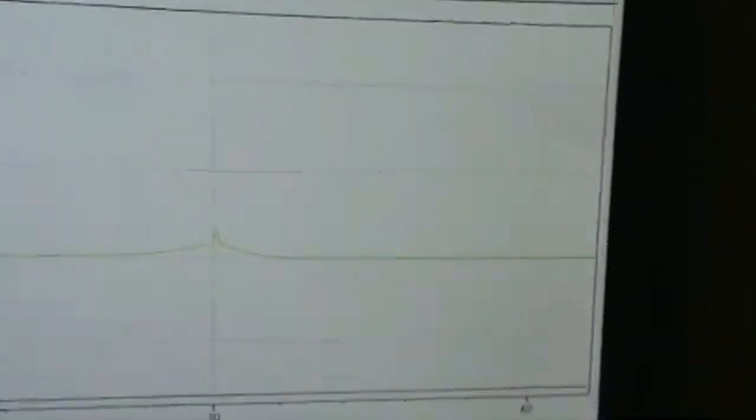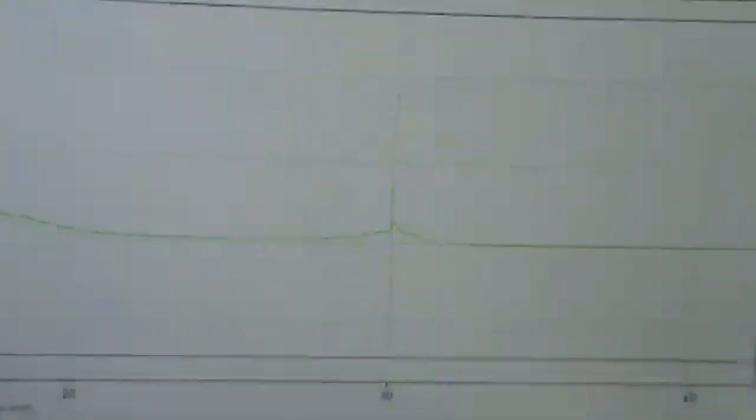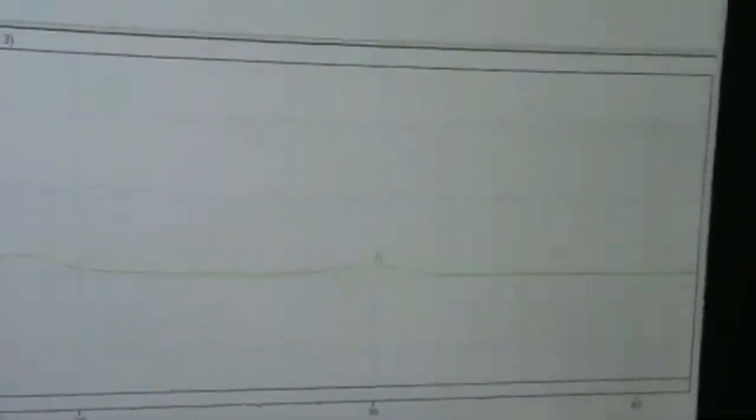So you right-click, zoom down, and zoom down. And so there is where our valve switched. And it looks like we're actually in the middle of a peak where our valve switched, which we probably need to either catch that peak or back flush that peak. And this being nitrogen, that's a big sucker. And then that guy's right after nitrogen, and then that guy.